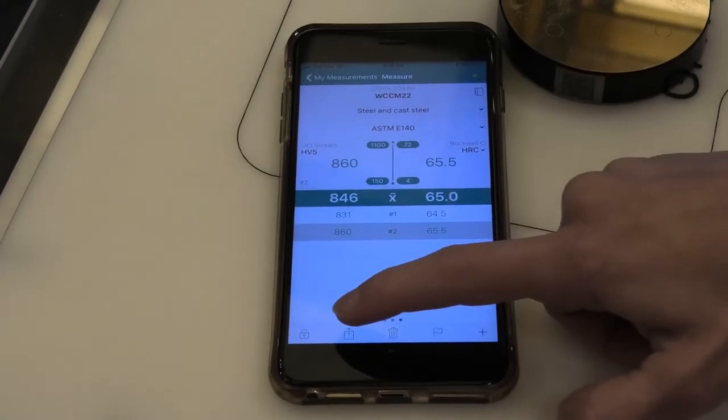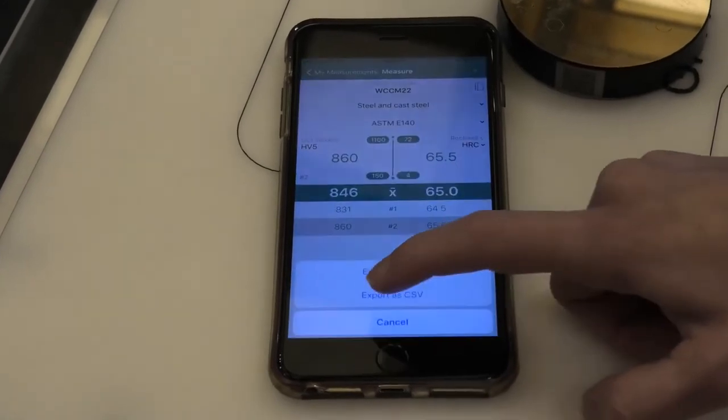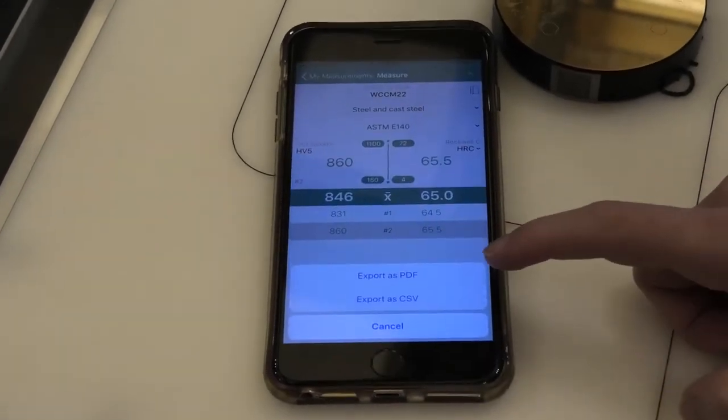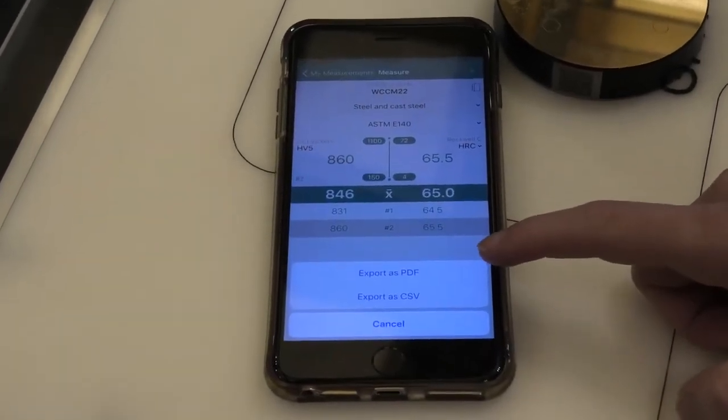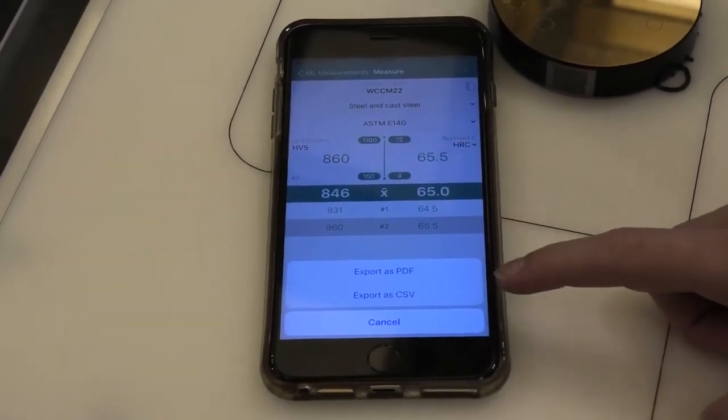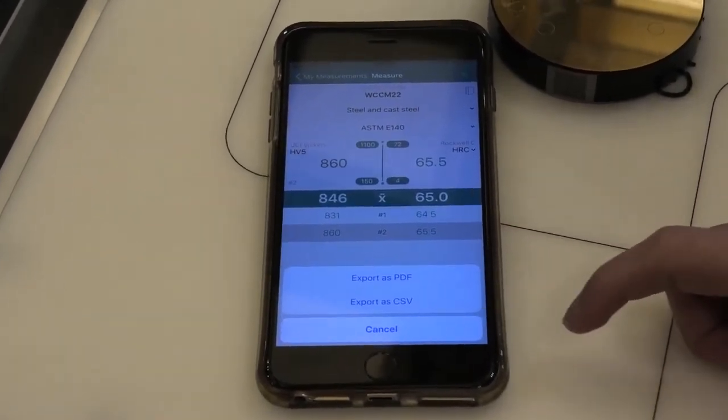And then I can export everything as a report, either PDF or CSV for Excel.